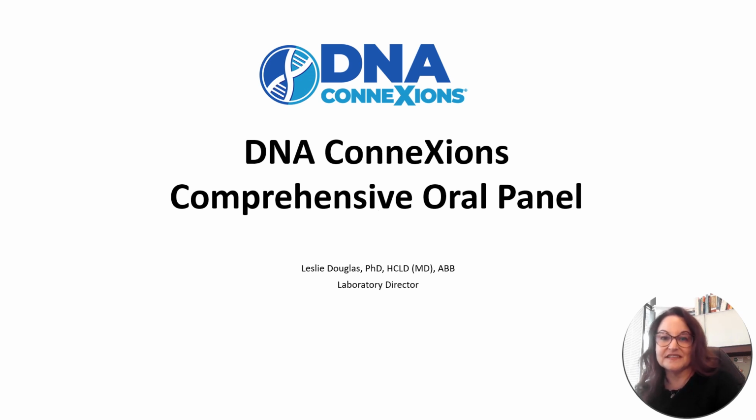Today I'm going to discuss the comprehensive oral panel, everything from proper sample collection, filling out the paperwork, returning your sample to the laboratory, and how to understand and best utilize the reported results.